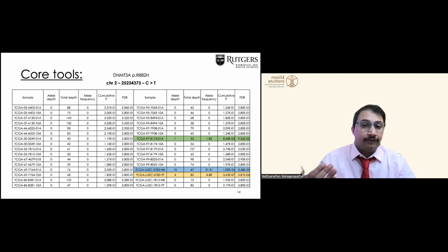But if we look at the false discovery rate computed by Backtrack, it's not much different from what we see for all the other samples that do not have any reads. This tells us that what we are looking at is most likely a sequencing error and therefore background noise. And the true signals are only from the pair in blue and yellow.